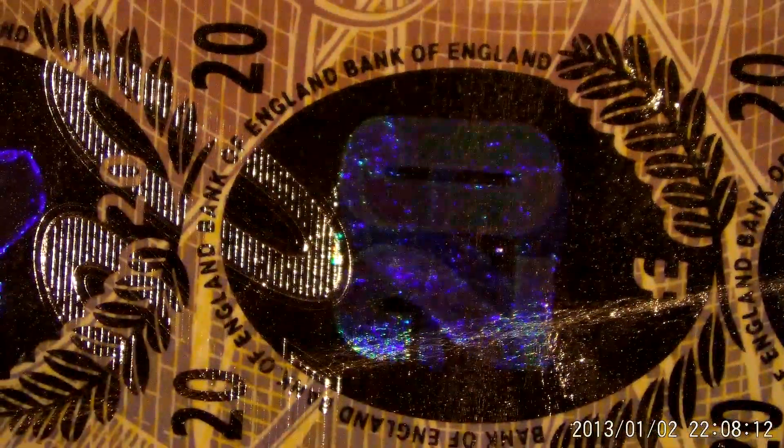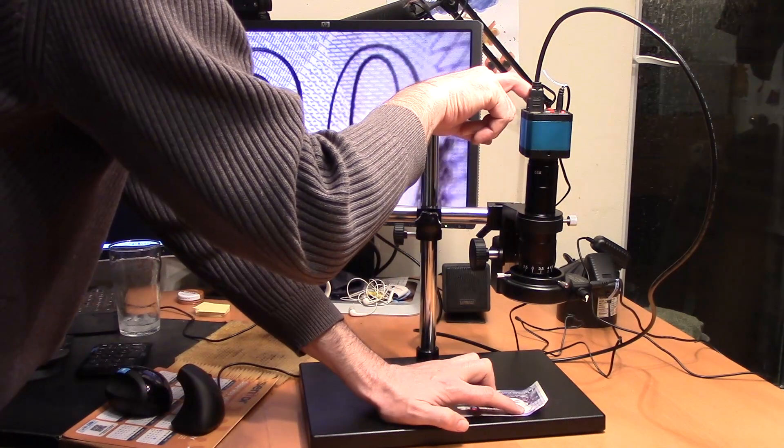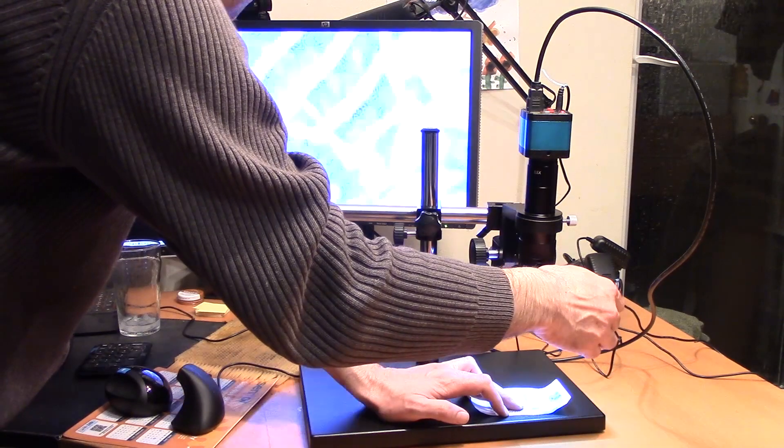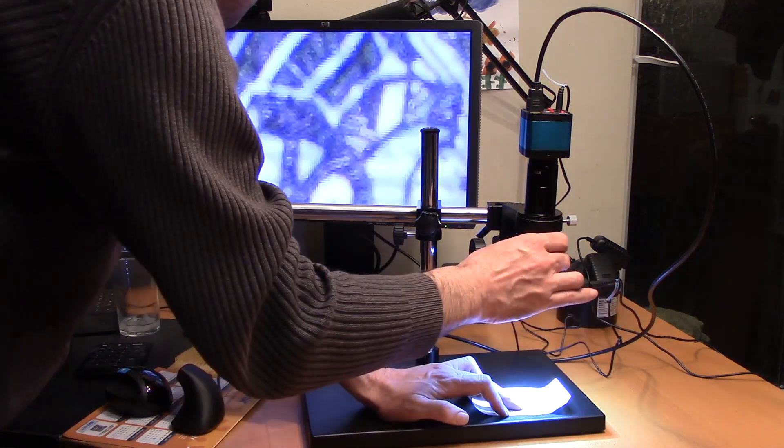This is our UK £20 note. That's Adam Smith's nose, which has got lots of 20s in it. We've got the silver strip woven through the paper there, lots of over-printing. And on the other side, we've got these shiny holograms. If I turn off the backlight — there we are, we've got '£' there. If I change the angle correctly, it should change to a 20. There we go. Let's have a play with the digital zoom — seven times zoom.